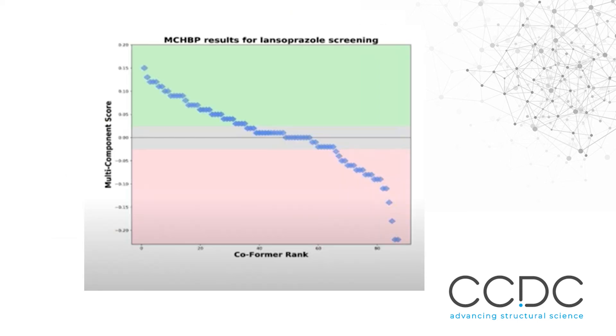If you run more, you will see something like this, a graph like this will be displayed with more conformers. And basically, that's it. You're ready to go. Good luck with your screening experiments. Thank you for listening.